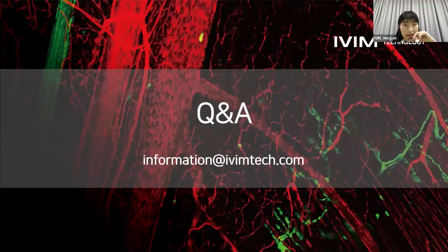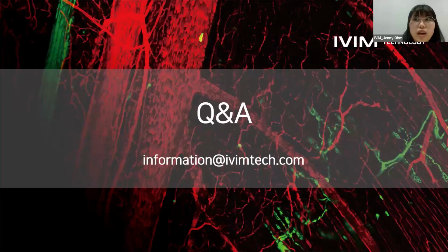And the third question is, is the two-photon laser only used for second harmonic generation imaging? Primarily, yes, it is used for imaging by utilizing the second harmonic generation, but it can also be very useful for imaging deeper areas in certain organs.